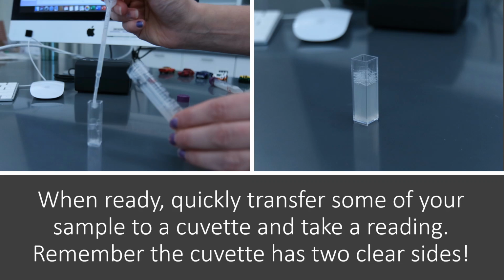This little tube here is called a cuvette, and you might be able to see, it's a little hard, but 2 of the sides are textured and have some ribs on them, and then 2 are completely clear plastic. The reason for this is that the colorimeter is really sensitive, so if you even get a single fingerprint on one of the clear sides, it will mess with your data results reading. So you need to make sure you only handle it from the textured side, not the clear side.